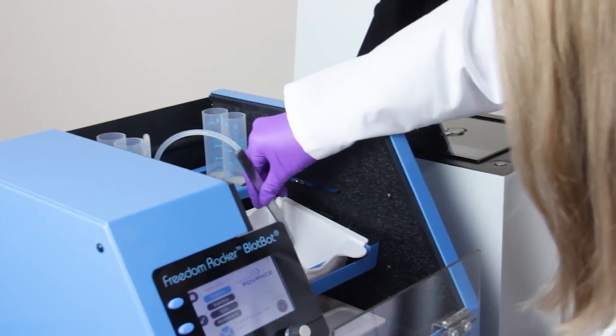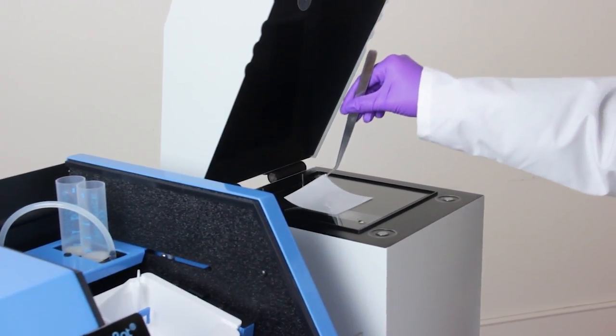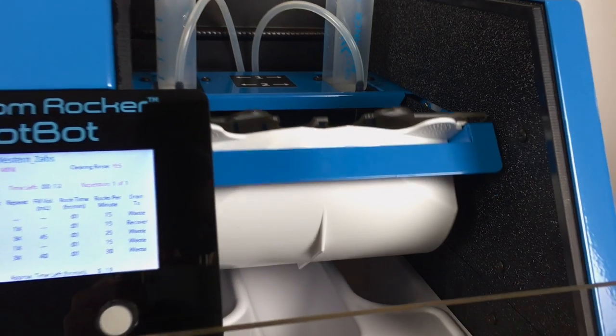The BlotBot can process several blots at a time, and they are completely done and ready to image when you return. If you run just two Westerns a week, the BlotBot will give you back about four hours of your workweek that you're currently spending babysitting your blots. It will pay for itself in increased productivity in just half a year.